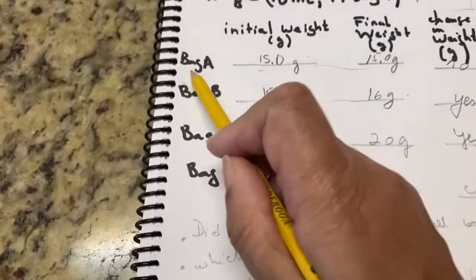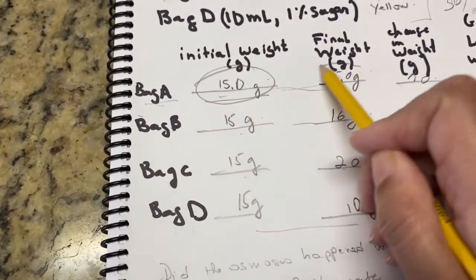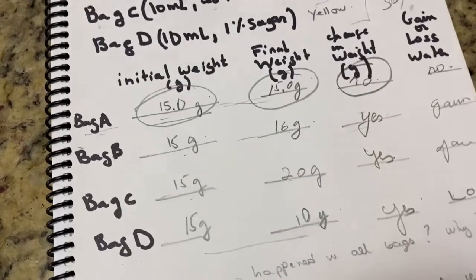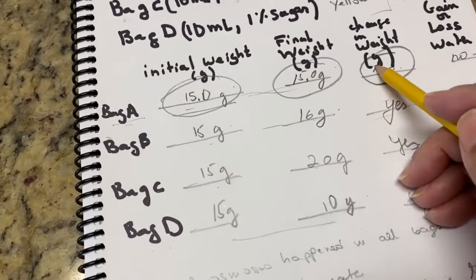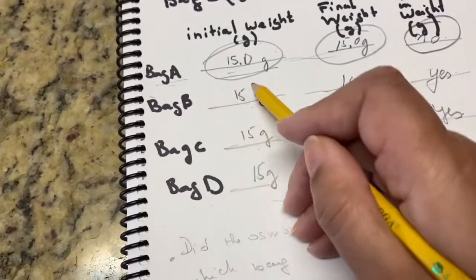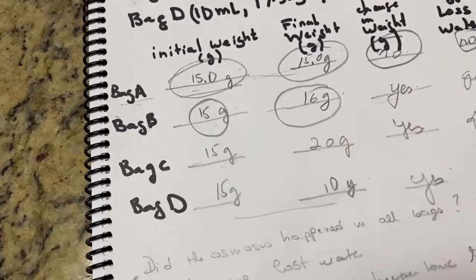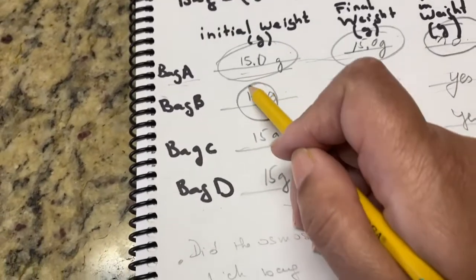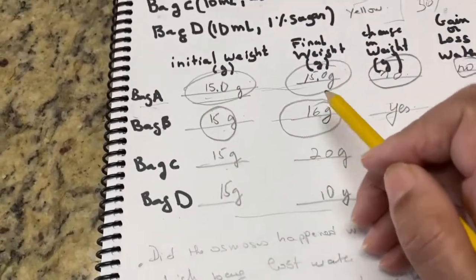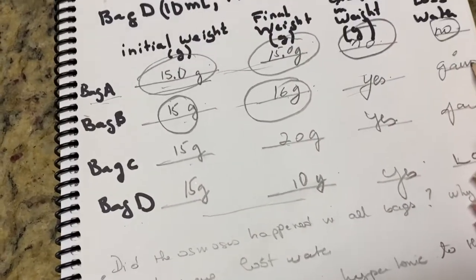Therefore, bag A, that has 1% of sugar, when I put it in a container with 1%, does not have any change in weight. So it doesn't lose or gain weight, all right? Bag B initially had 15 grams, and after 30 minutes in a container with 1% sugar, when it contained 10% sugar, it does gain weight, almost 1 gram. So it does gain, right?